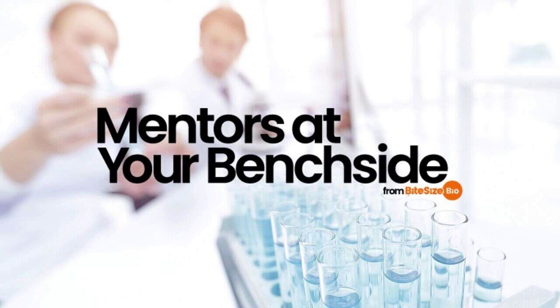Irrespective of the way you amplify your vector using chloramphenicol, treat the resulting cultures as containing a high copy number vector. First of all, don't overload the midi-prep or maxi-prep column with lysate. Use the minimum volume of culture according to the protocol. Elute with the maximum volume of buffer and repeat the elution. You can always concentrate the DNA later.